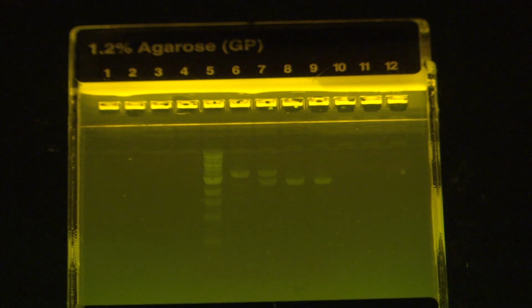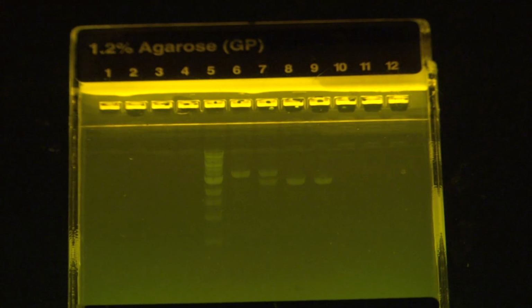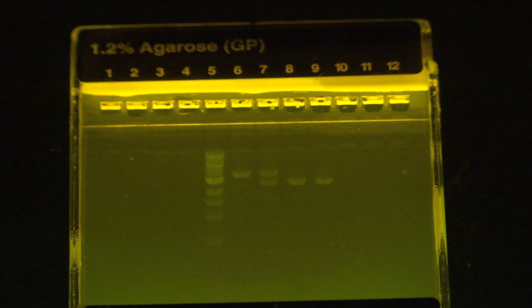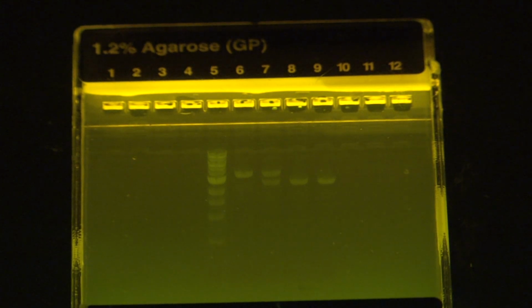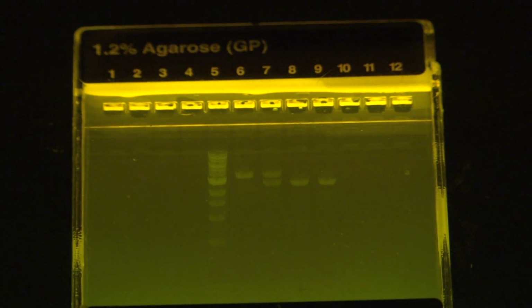For instance, in lane 9, you can see that there's a single band, whereas in lane 7, there are multiple bands. So what I'd like you to do now is take a moment to discuss why you think it is that some people show one band, whereas other people show multiple bands. I'd like you to write down for each person how many bands that you see, whether those bands are longer or shorter, and then also explain why some people show multiple bands and some people show one band. We'll discuss the answers to these questions when we come back.